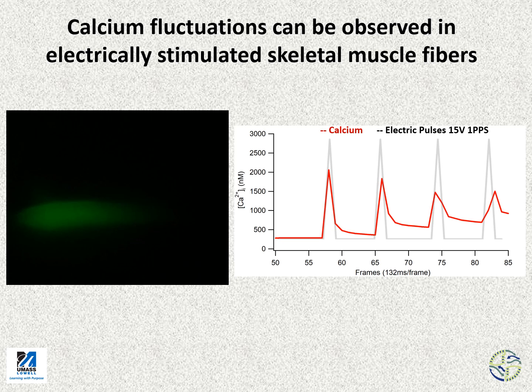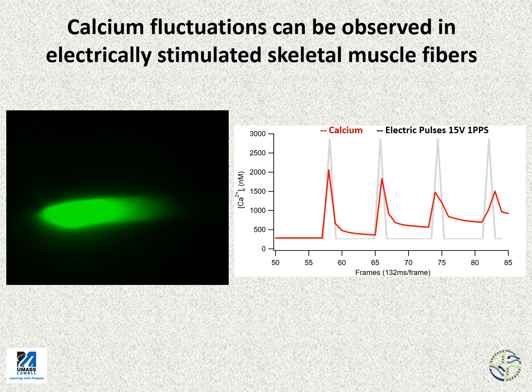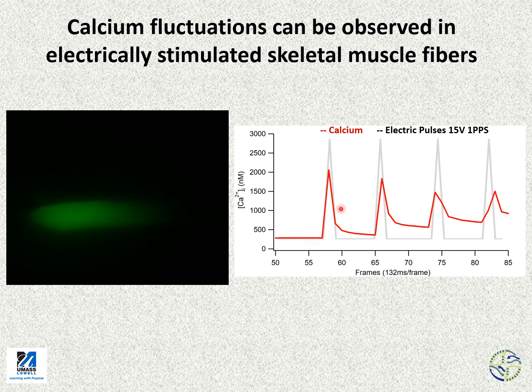Here I'm showing a muscle fiber that is electrically stimulated using a 15-volt, 25 millisecond pulse duration at a frequency of 1 pulse per second. And as you can see, there's a calcium pulse associated with each stimulation.